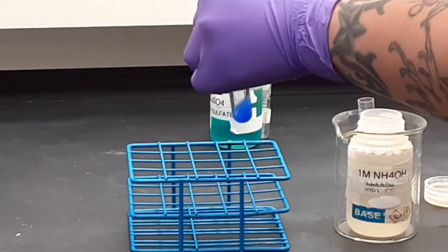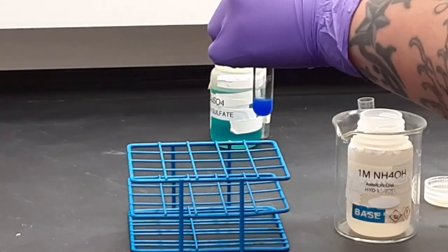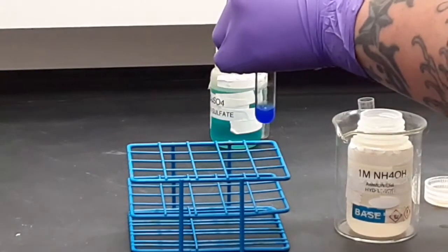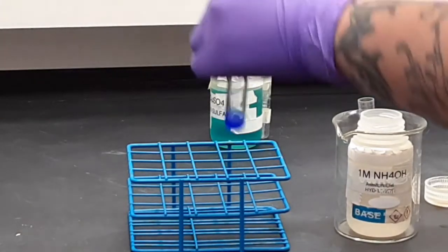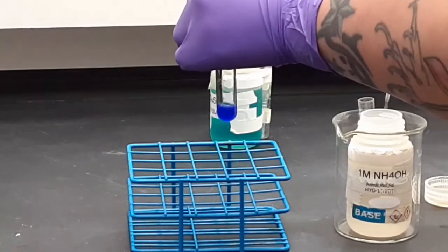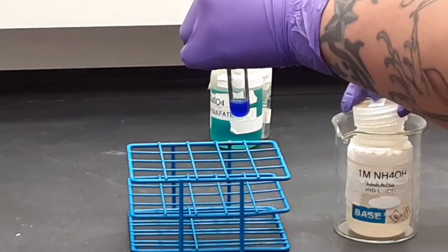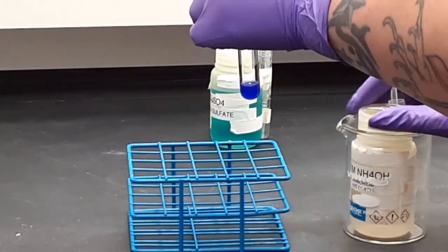Entering into the third color change. Heather is satisfied with this color.